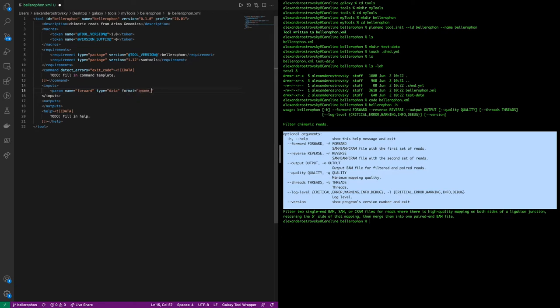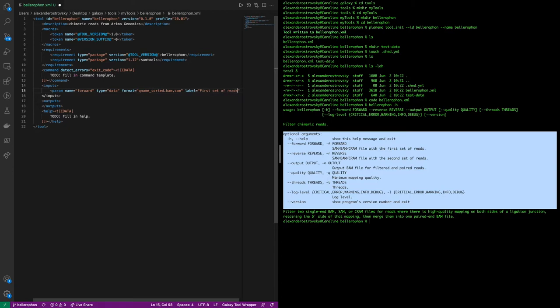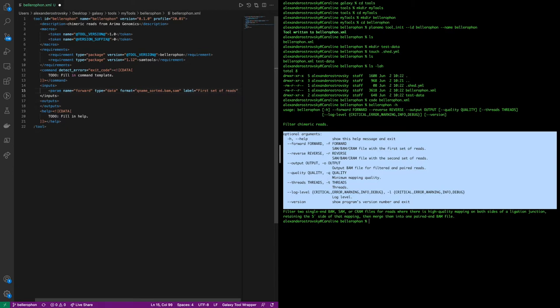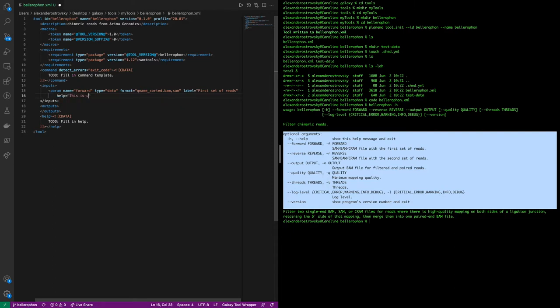The first parameter is forward. Here we will set the name, which we will use to refer to this variable internally within the command section. Then we will set the variable type, which in this case is an input file, and therefore we put data, as well as the format of that file, which can either be a name-sorted BAM file or a SAM file. We also set the label, which is the name of the variable that will be shown to the user, as well as some help text.